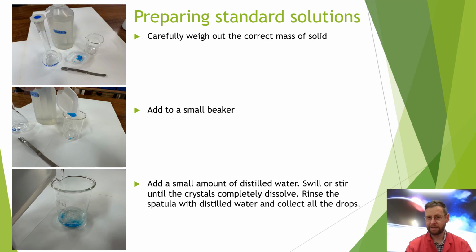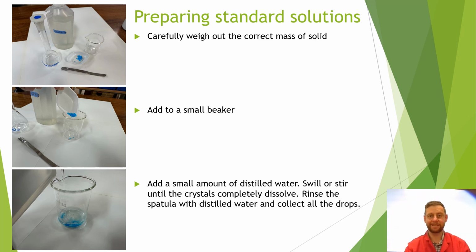So how do we achieve that level of accuracy? Well, there's a process for making up a standard solution, and this is it. First, we need to measure out the mass of the solid using a top-pan balance and the substance in question.